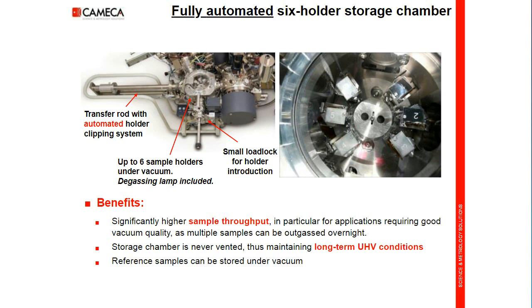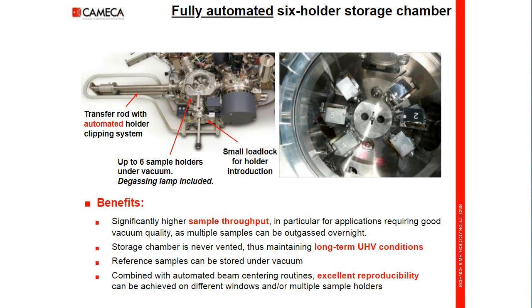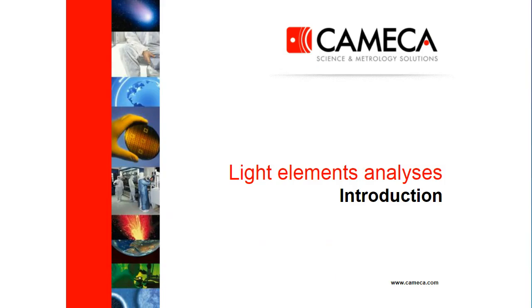Combined with automated routines for precise centering of the secondary beam, excellent short and long-term reproducibility can be achieved on different windows of a given holder and/or multiple sample holders. I will now focus on the light elements application.